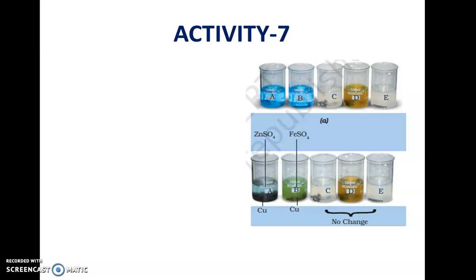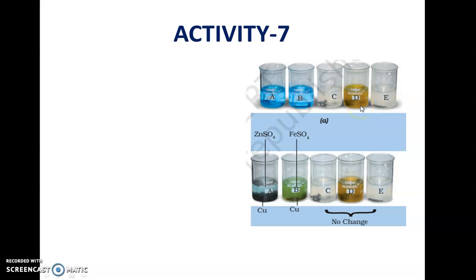These are five beakers: A, B, C, D, and E. In beakers A and B you will find a light blue solution. In beakers C and E there is a transparent liquid — a transparent solution. In beaker D there is a brownish color solution.